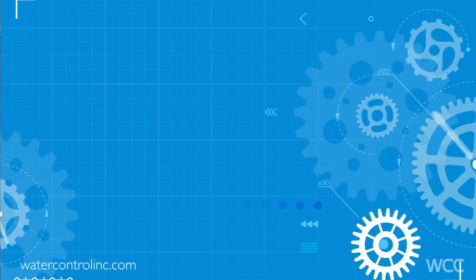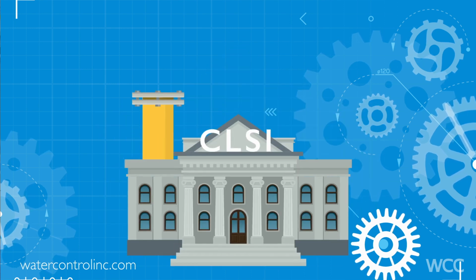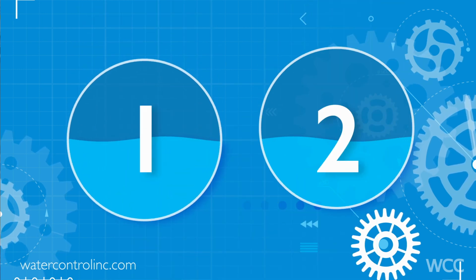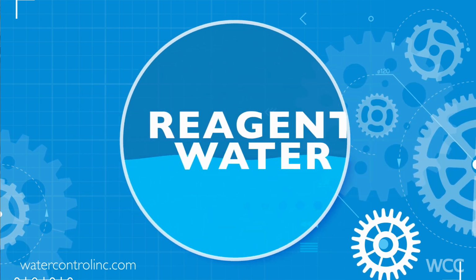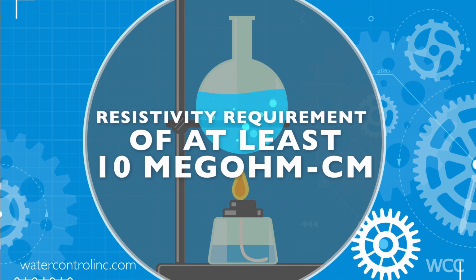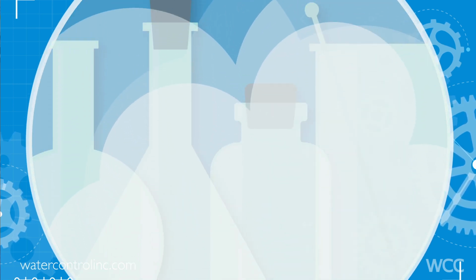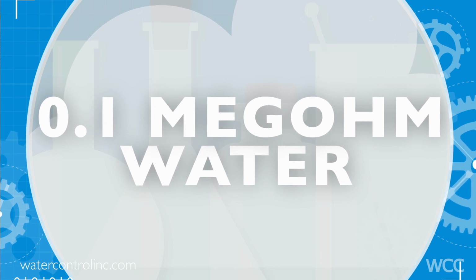The Clinical and Laboratory Standards Institute, CLSI, used to have a type 1, 2, and 3 classification for pure water used in medical facilities. To minimize confusion, though, this was recently reduced to 2 basic categories: reagent water, which is used in medical tests and experiments and has a resistivity requirement of at least 10 megohm, and water for autoclaves, which is used for feeding medical sterilizers and is generally known as 0.1 megohm water.